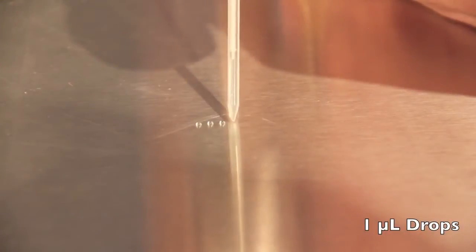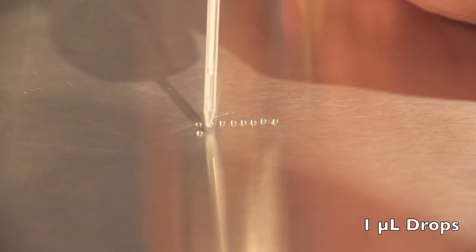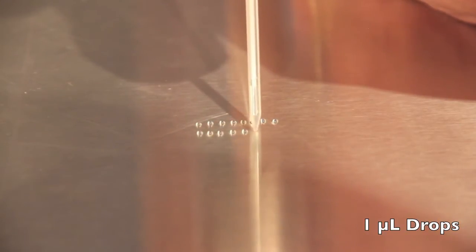With nine syringes to choose from, the Ritter Repet Gen X is able to dispense from one microliter up to 50 mils. In this shot, we are dispensing one microliter drops onto our countertop.